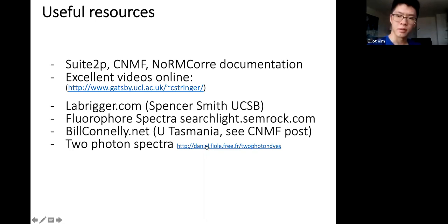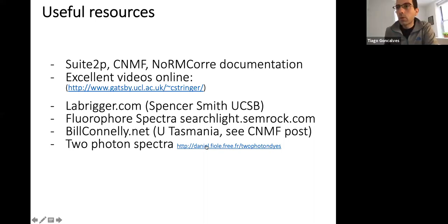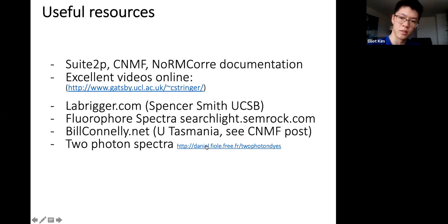I had a question about last lecture. You talked about deconvolving the point spread function. Is that something that you usually do to get higher spatial resolution?